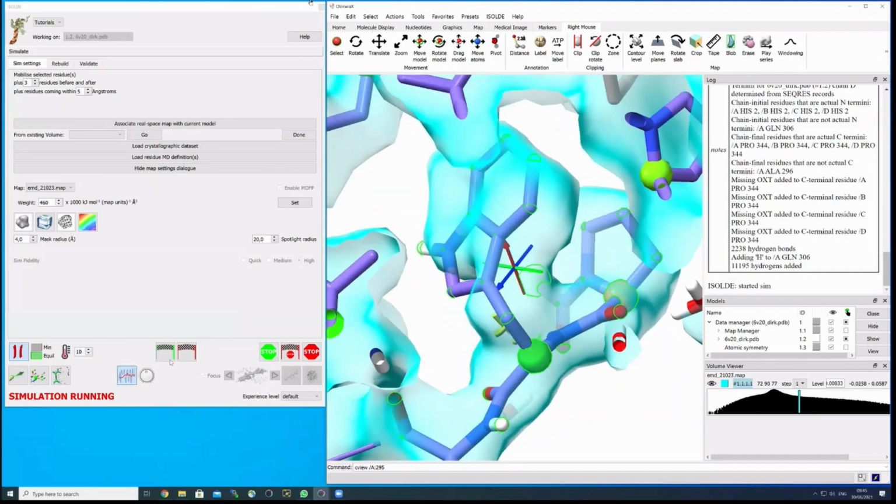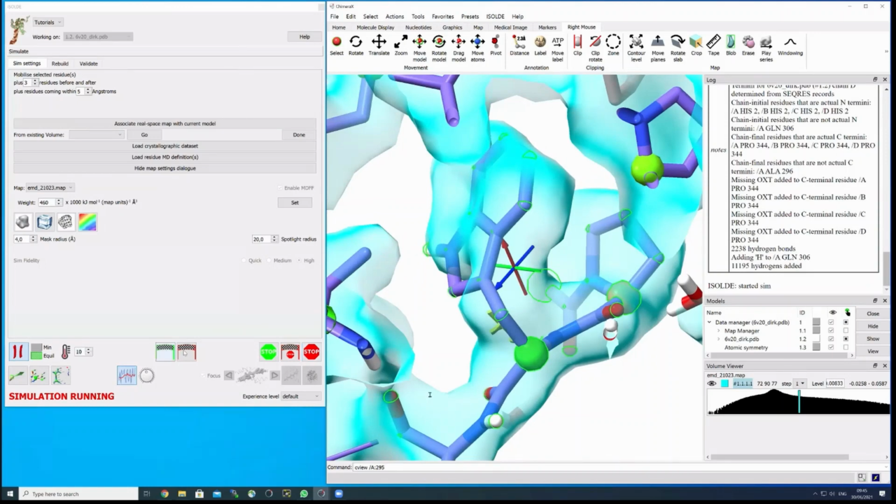So down here now, you will see that 3 new buttons appeared. So we have this green racing flag, the red one, and the green stop sign, the red stop sign, and the red stop sign with the racing flag. You always have this little information that comes along when hovering over the button. So what these flags mean is if you press on it, it will save a checkpoint. That means whatever I do will be saved.